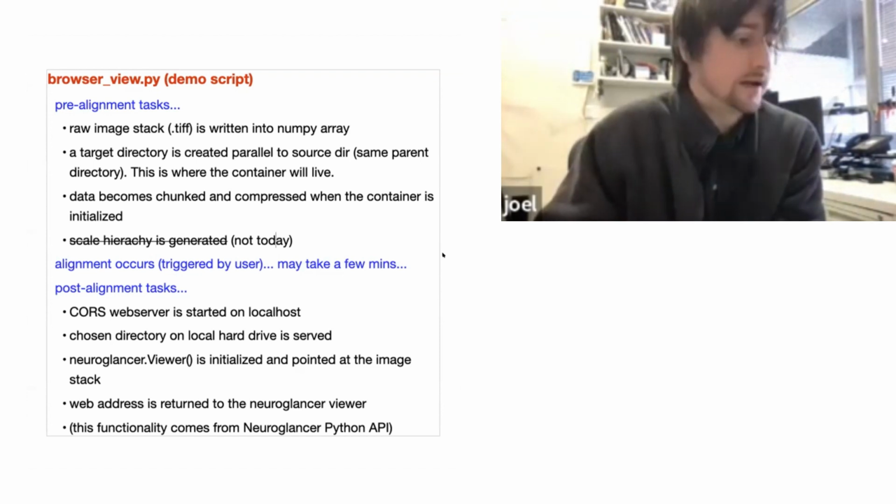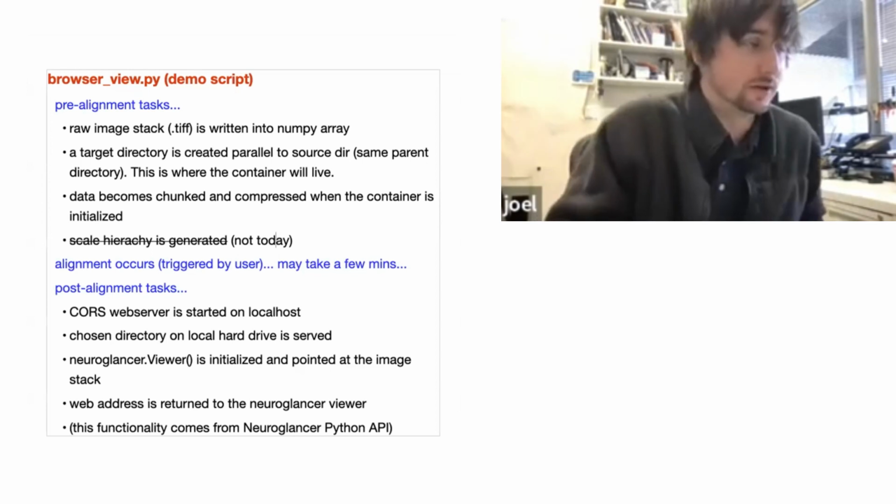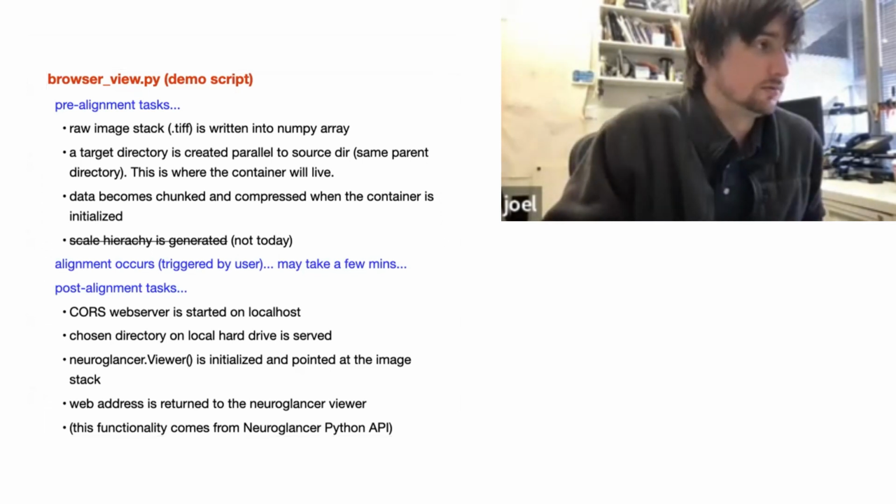So the state of whatever you're looking at is easily transmissible because it's all being done through JSON. You can represent anything with JSON, it's just really good for being easily transmissible. And so I hope that makes sense. So let's do that then.